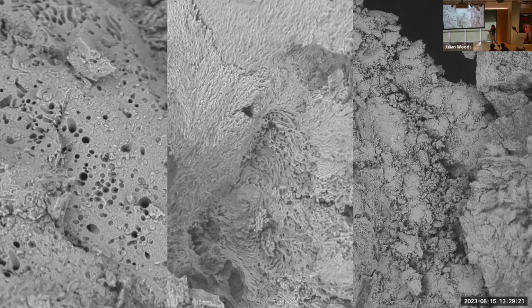Yeah. So Sarah's right. Over in these 2 sections here, you can see there's a lot of holes. It's quite a porous structure, or maybe there's kind of like a fur growth pattern happening here. These 2 on the left are actually bones, and on the right here is dirt, just plain old dirt. And you can see the immediate difference in surface structure and that information that it could give us in terms of looking at our artifacts and what they're made of.